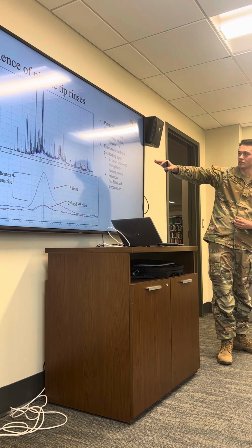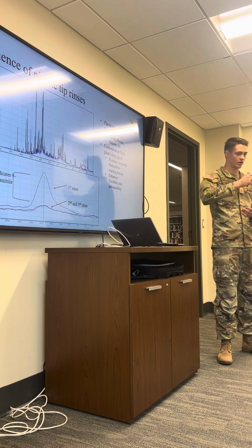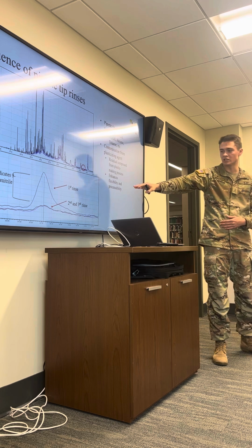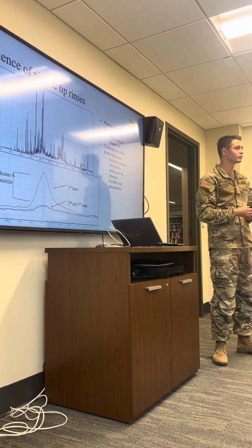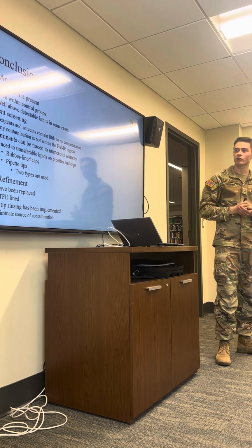What we can see is that we would first rinse the pipette tip with one rinse of our solvent, then put it into a waste container, and then we do it two and three more times. What we see is that the residue then goes down to below detectable limits, to where it is not interfering with our data.